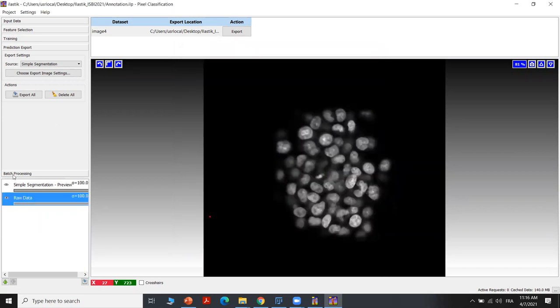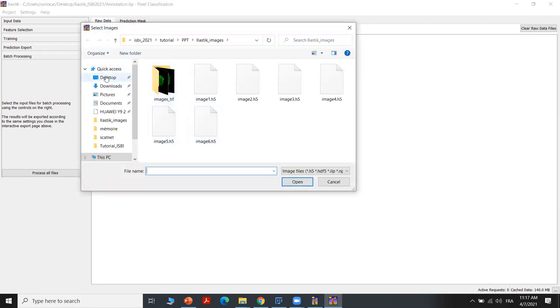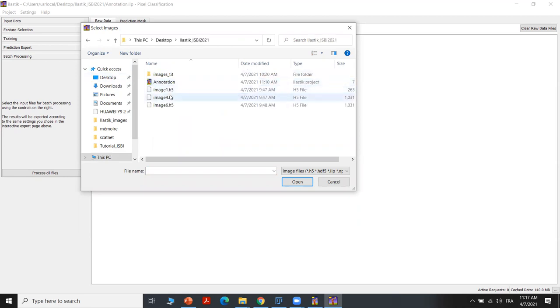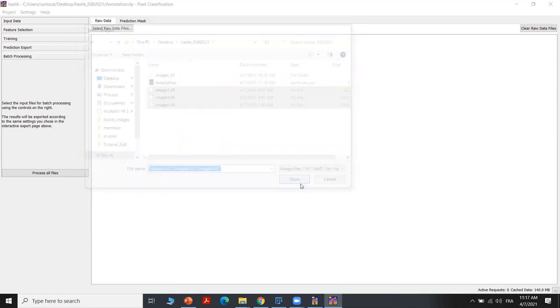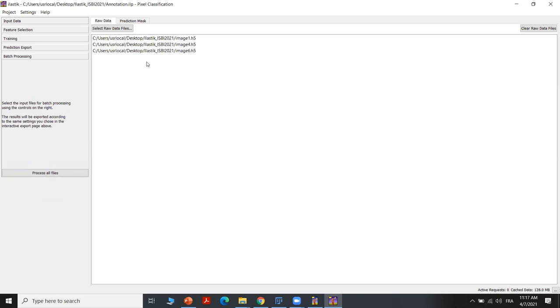Now let's move to batch processing mode. Here we can apply the trained model on all the other images we have. We can select raw data — we have all three images — and select them all, then click on 'process all files'. In this case, each image will be segmented and then saved in the same folder where we have the original image.